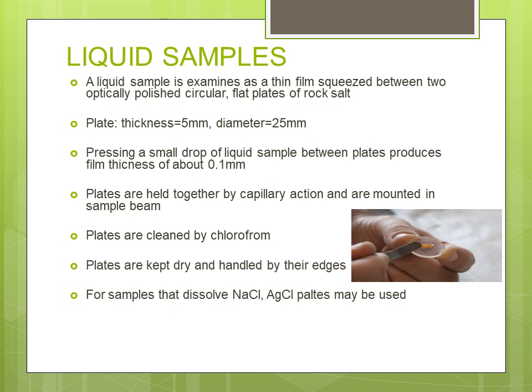Plates are held together by capillary action, and these are mounted in the path of the sample beam, and in this way the sample spectra is recorded. Then after use, plates are cleaned with chloroform. Plates are kept dry and handled by their edges. For those samples that dissolve sodium chloride, silver chloride plates may be used.